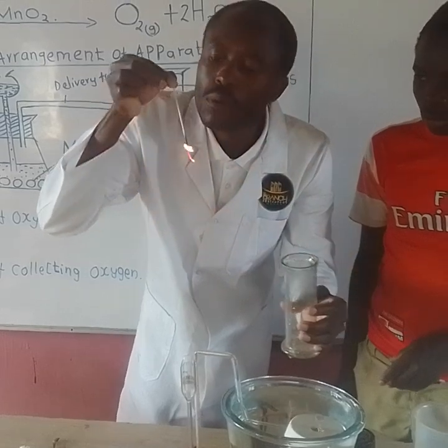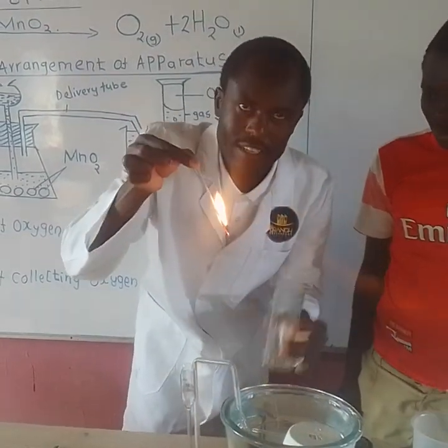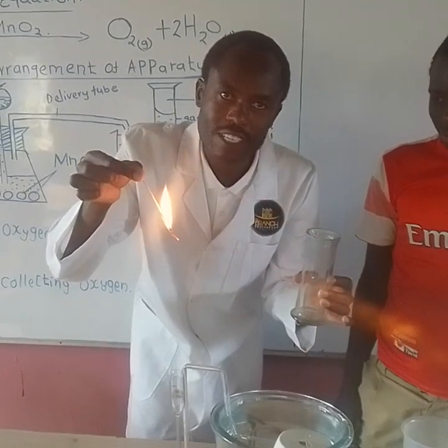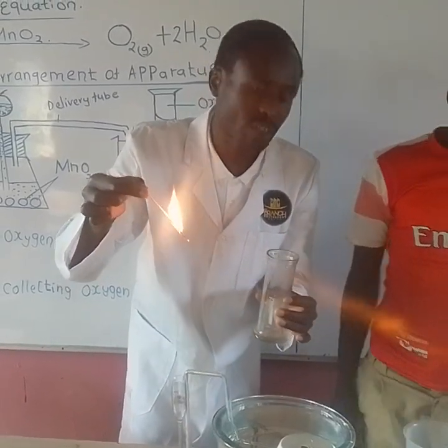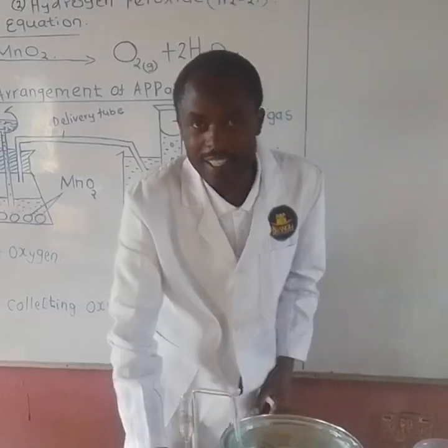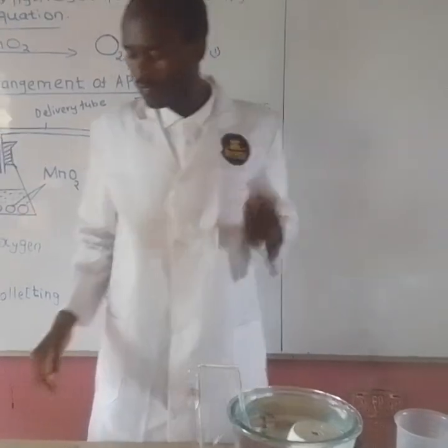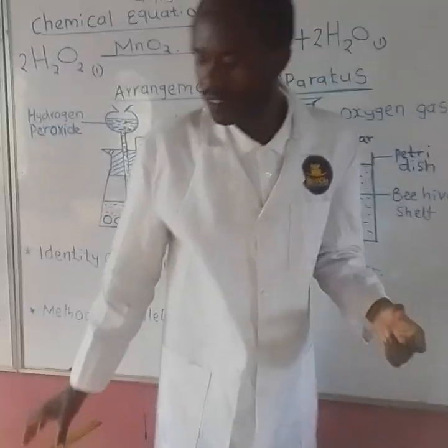It gets relighted. Are you seeing that? Oxygen relights a glowing splint. Is it okay, my student? Thank you, Emmanuel. You can go back. Thank you very much. That is very good, Emmanuel. So my student, you can now focus on the board for 1 minute before I finish.